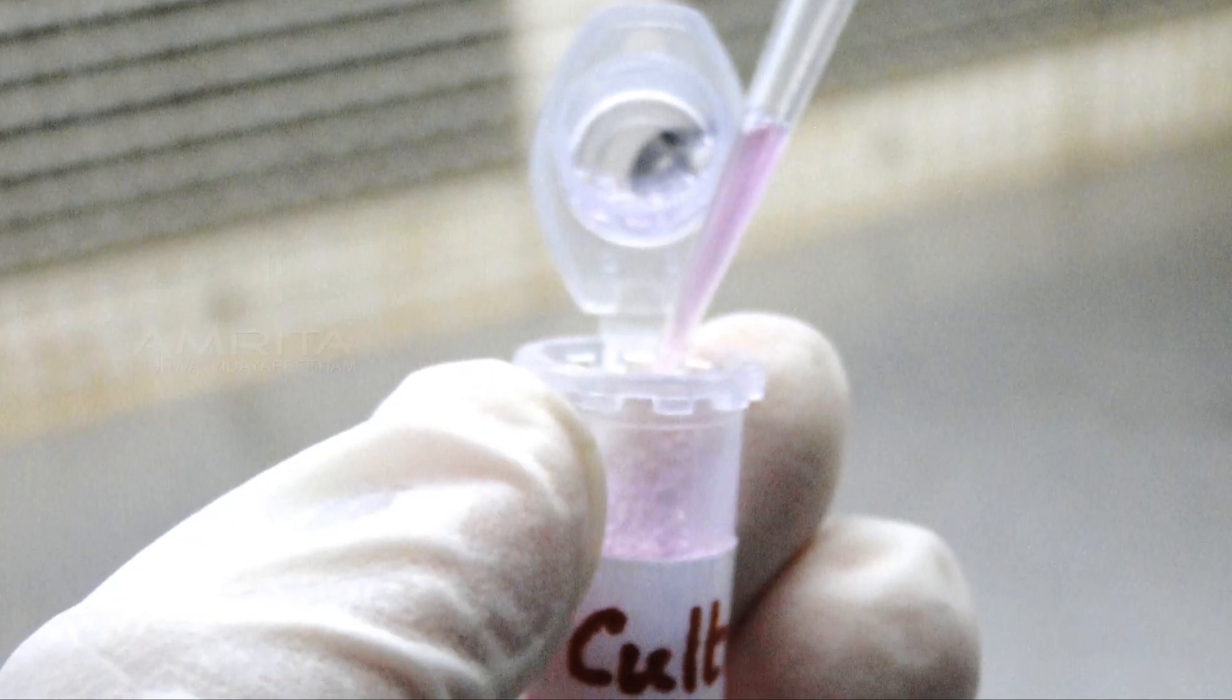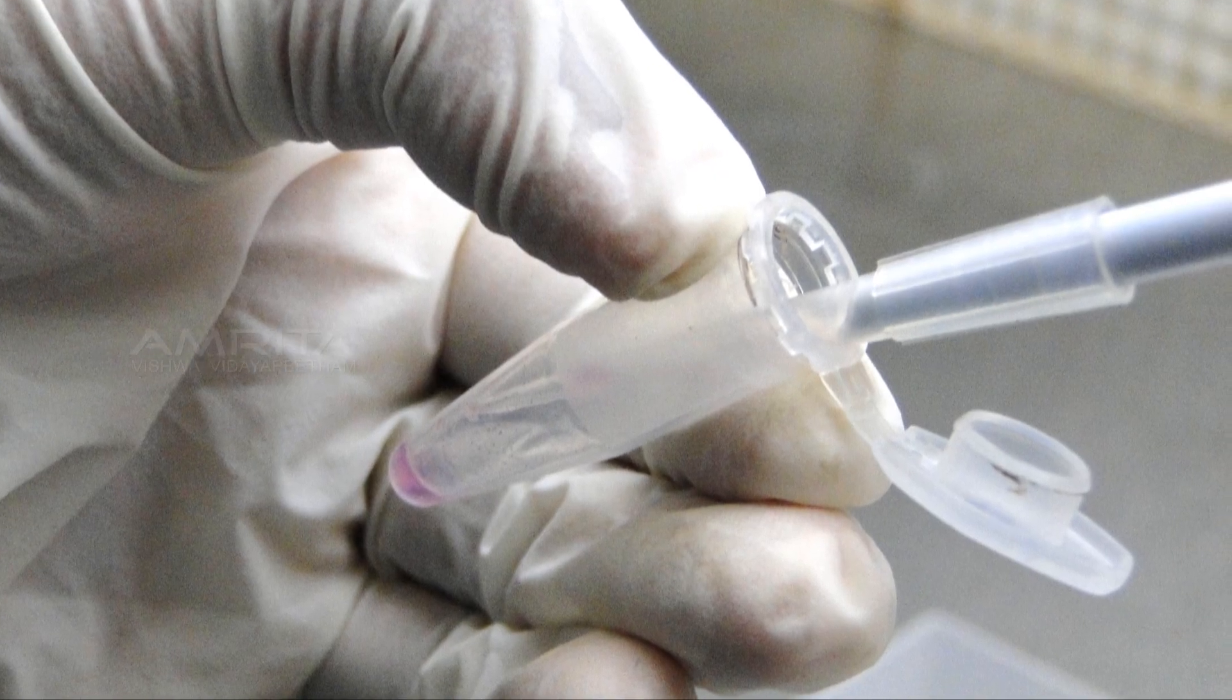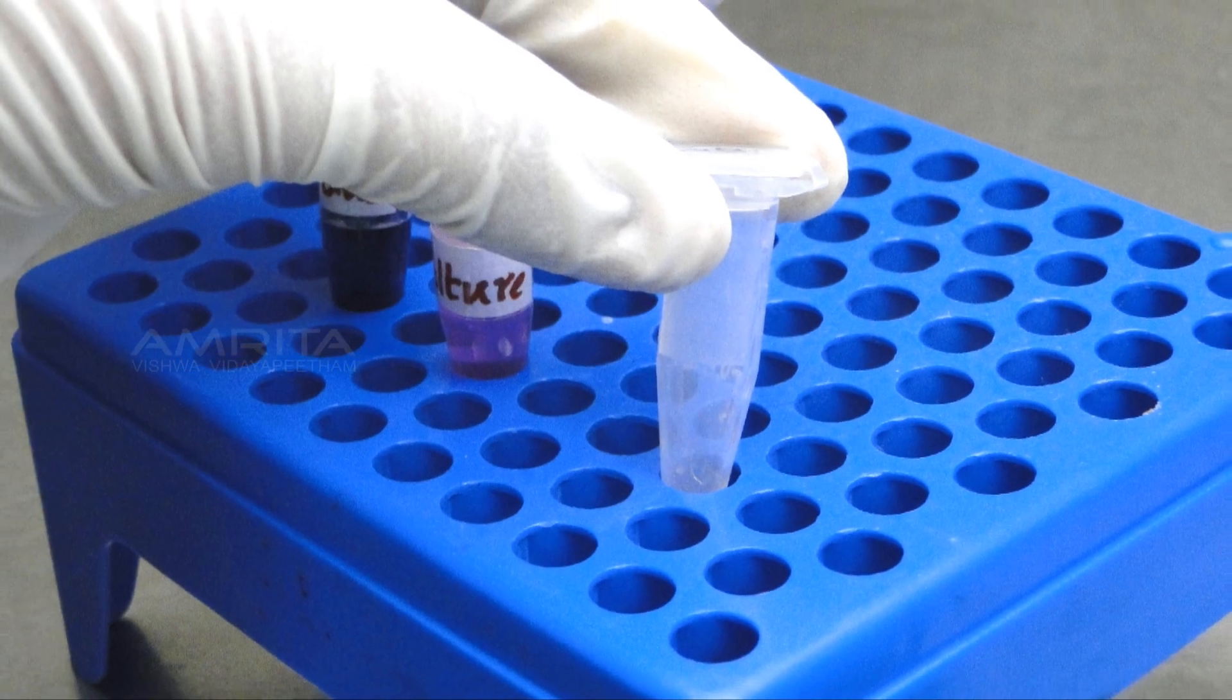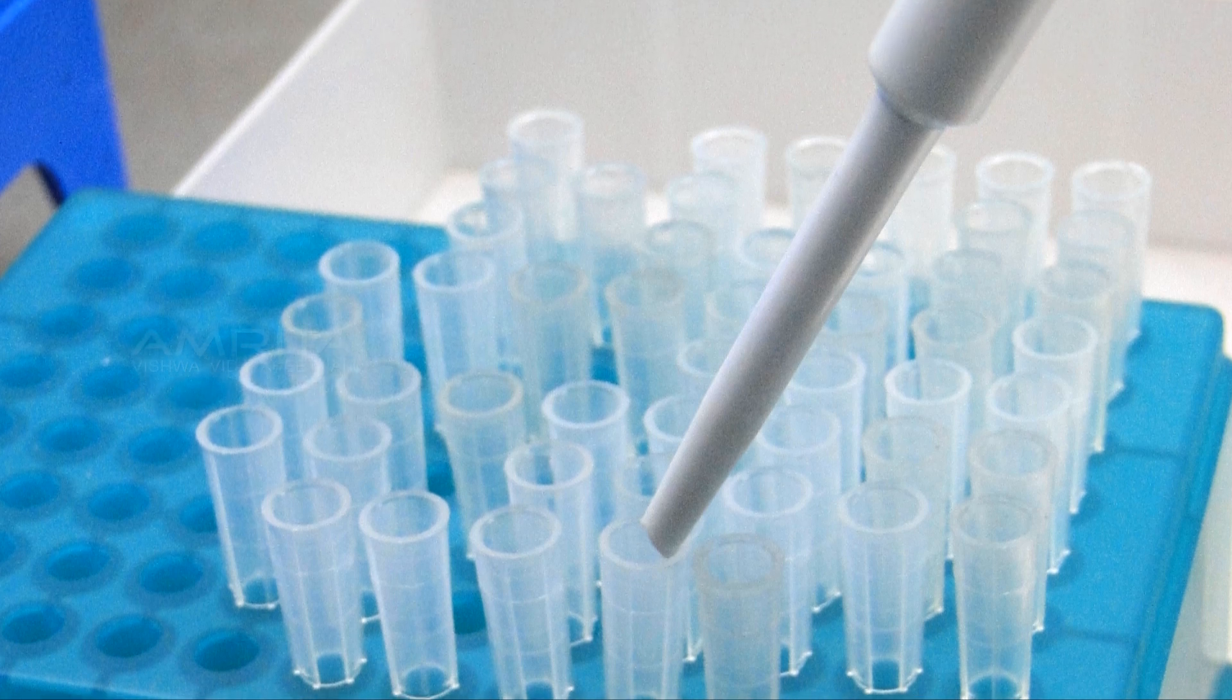Now take 10 microliters of the suspension with the micro pipette and transfer it to a fresh vial. Close the vial and keep it in the vial rack. Dispose the used pipette tip. Insert a new pipette tip to the micro pipette.